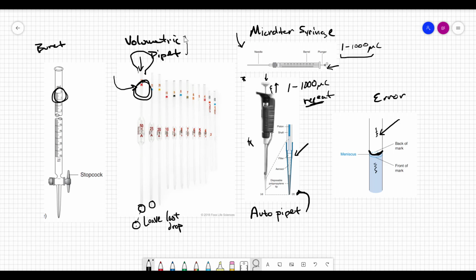So you're looking down at a 45-degree angle like this on your flask, and instead of having two lines that are perfectly parallel to each other and overlapping, you have them create this little oval, and your meniscus can cut right between them. If you're looking at it directly side on, then the front mark and the back mark will look the same, and your meniscus should just touch the top for the least error in the volumetric measurement.